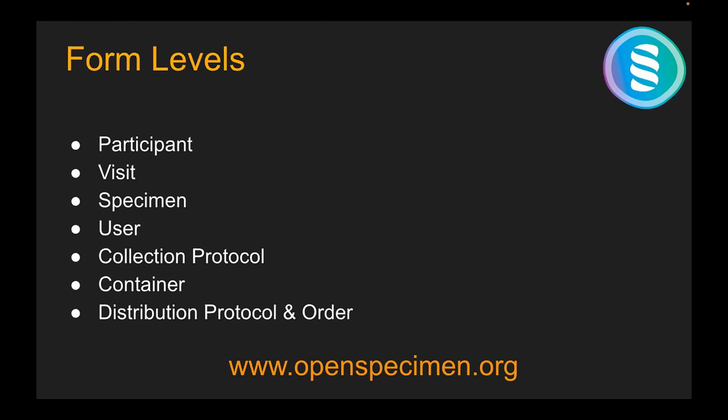Now, these are the primary levels where forms can be attached. One is participant, visit, specimen. Even on the user level, you can attach certain forms. For example, you have some agreements that you do internally that can be stored against each user.